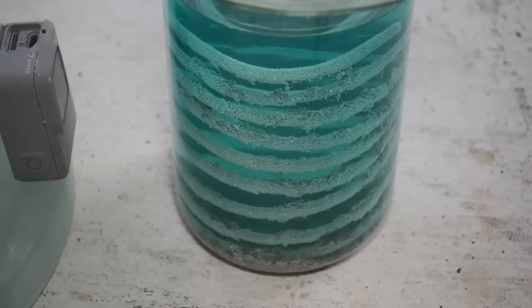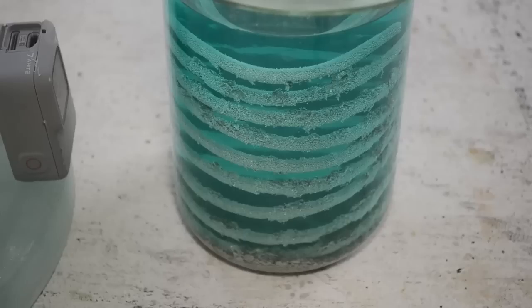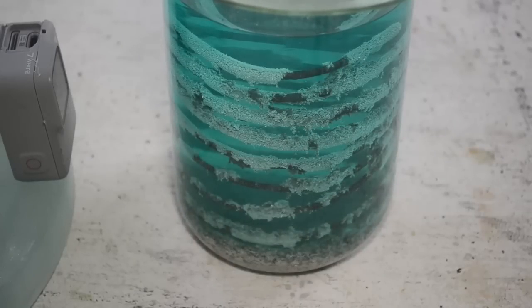So we're about 10 minutes into the cementation, not quite 10 minutes, and there's quite a layer of silver metal accumulating on the bottom of the beaker. The liquid is turning quite blue. So this is going very well, very quickly. Oh yeah, look at that. So, yeah, it's going quite well.